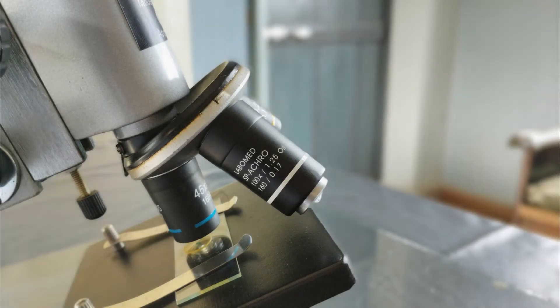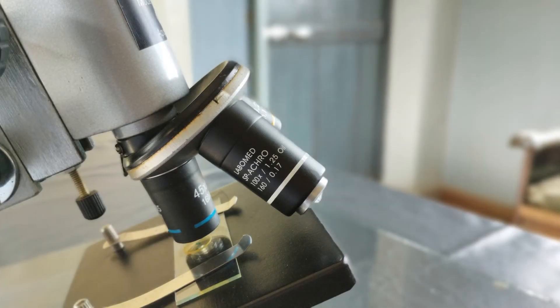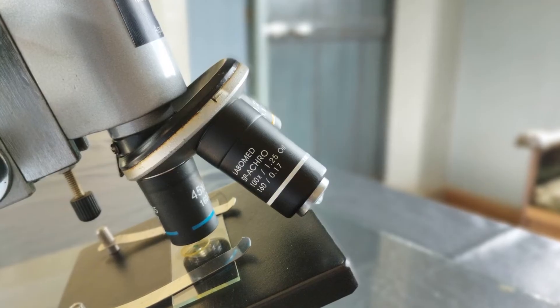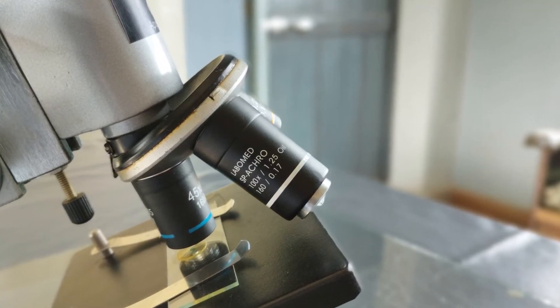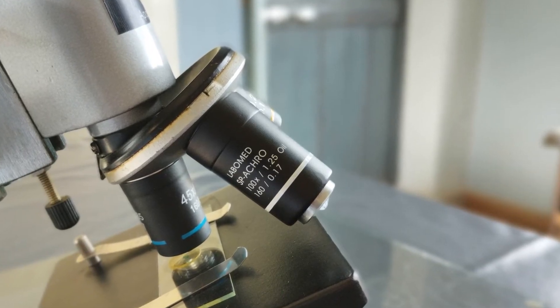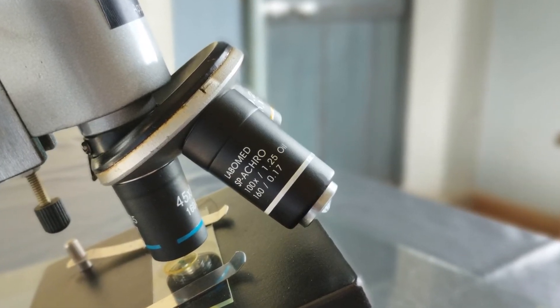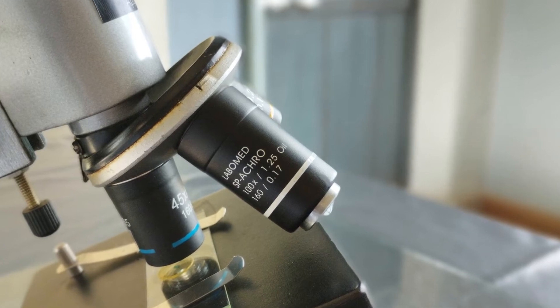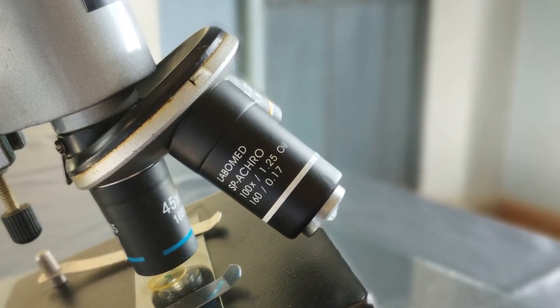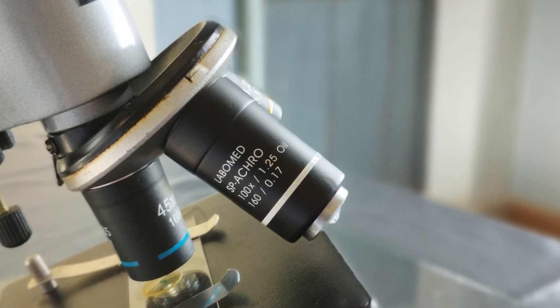Now coming to the usage of the highest power objective in a brightfield microscope, also known as the 100x immersion lens. There are certain fields in biology where minute details or extremely tiny objects such as bacteria need to be examined. This is where the immersion lens comes as a great add-on advantage in microscopy. The most commonly known and widely used high power immersion lens is the 100x oil immersion lens.